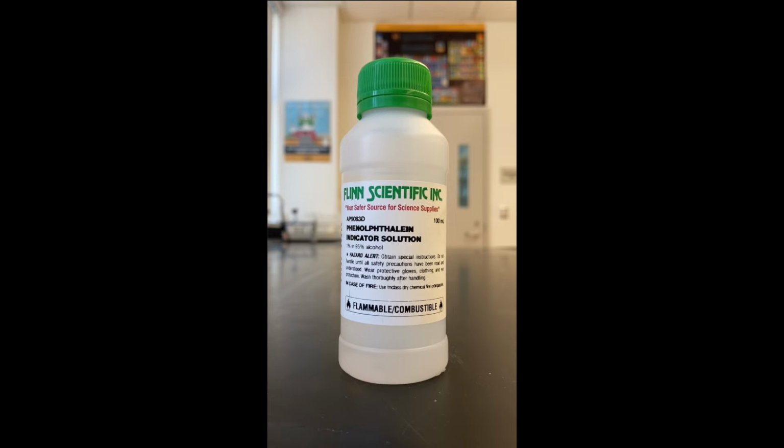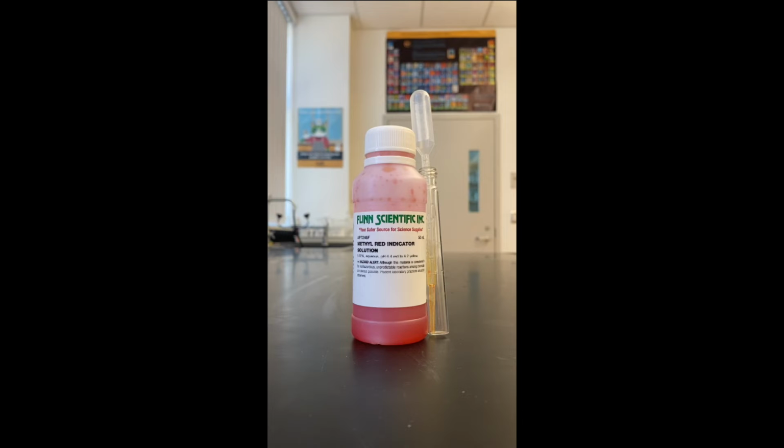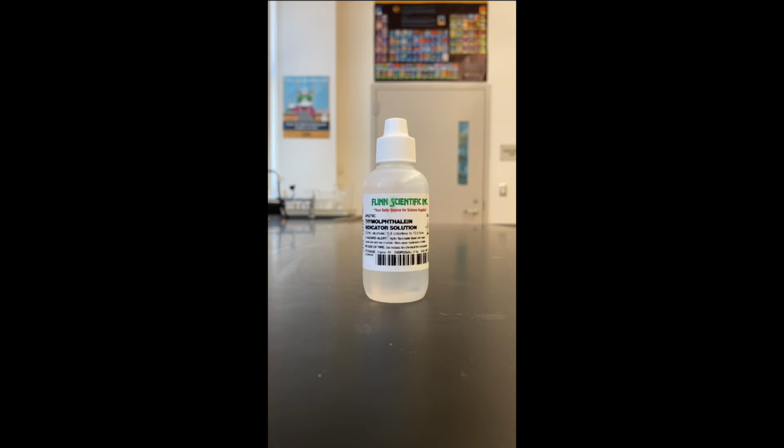After choosing your chemicals, you must next choose an appropriate indicator to use. Strive to choose an indicator that has a transition interval around the equivalence point in your titration curve, so that when the endpoint is close to being reached, you know to titrate in smaller increments. Although there are many more indicators to measure pH, you will have 3 to choose from. Phenolphthalein, which changes color between 8.2 and 10, methyl red, which changes color between 4.4 and 6.2, and thymolphthalein, which changes color from 9.3 to 10.5.